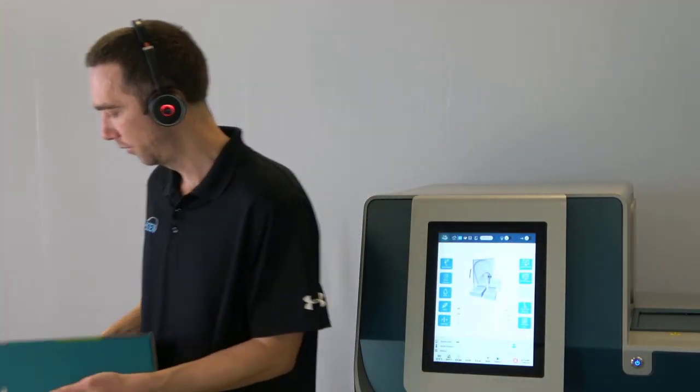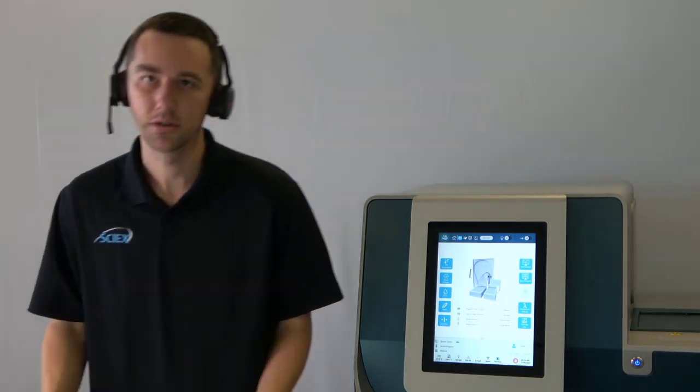All right, that's pretty much a good look at our reagents. So before we continue on, let's just do a quick overview of the sample prep that we use to really analyze these samples.